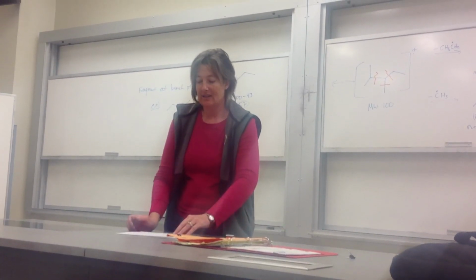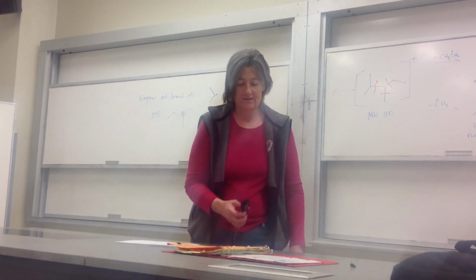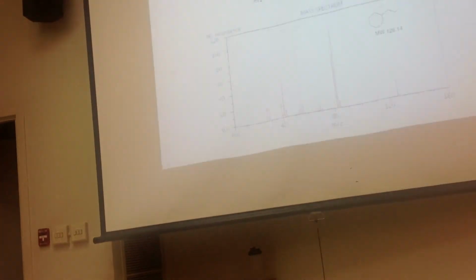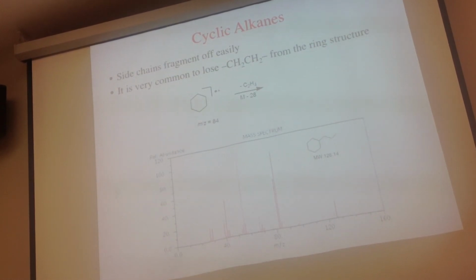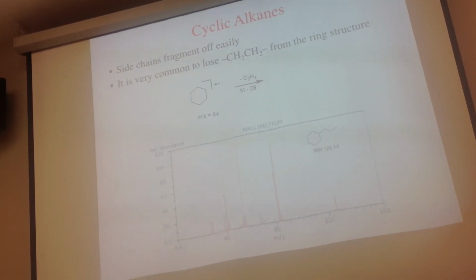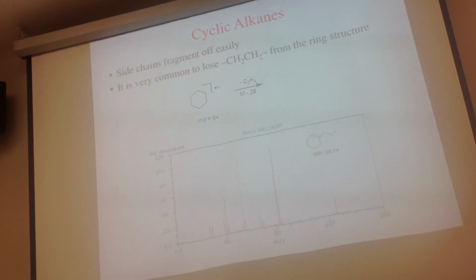Okay. The last of the alkanes, cyclic. Cyclic alkanes have a couple of common fragment patterns initially that can help you identify them. And then you just kind of have to fish around in the dark hoping you can figure out what's going on. They're not quite as nice.